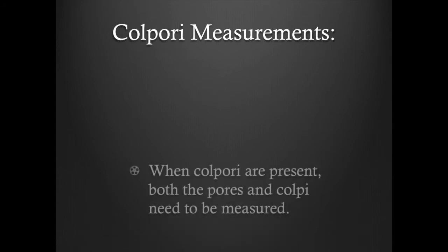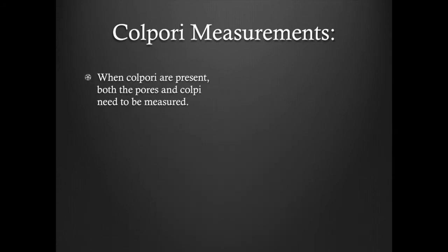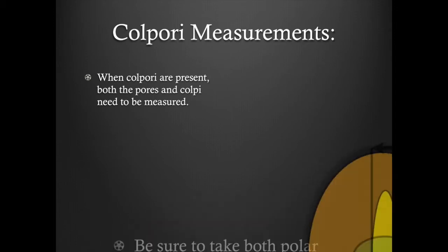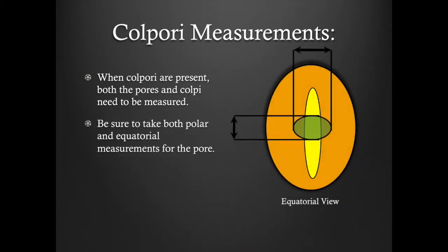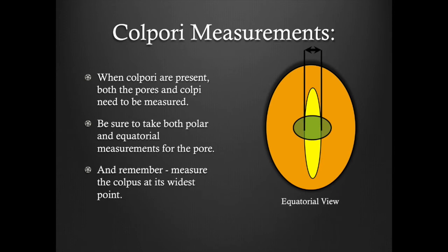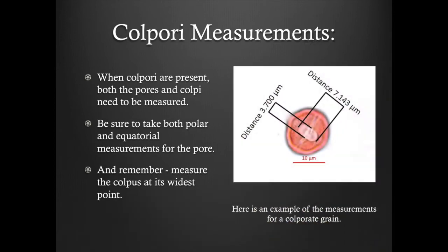Colporate measurements. When colporate apertures are present, both the pores and the colpi will need to be measured. The same methods of measuring apply. Be sure to take both polar and equatorial measurements of the pore. Also, be sure to measure the colpis at its widest point. Here is an example.